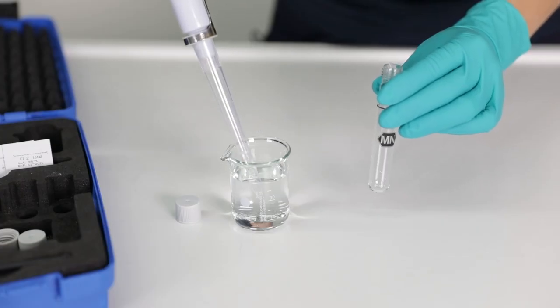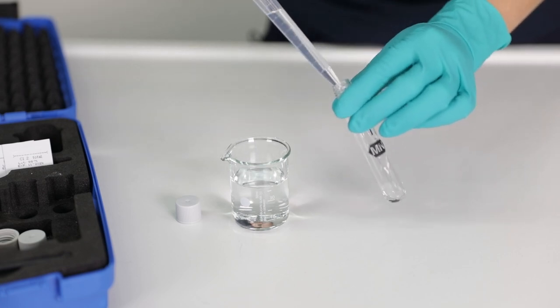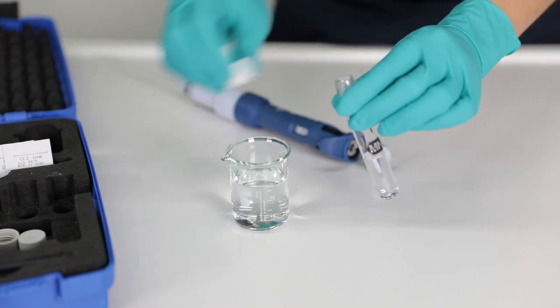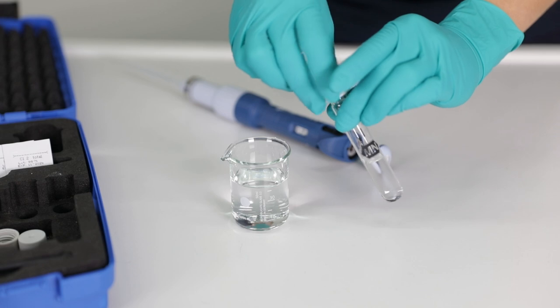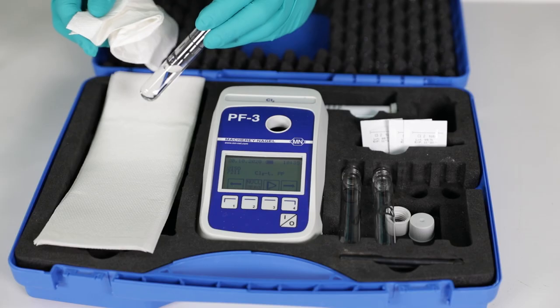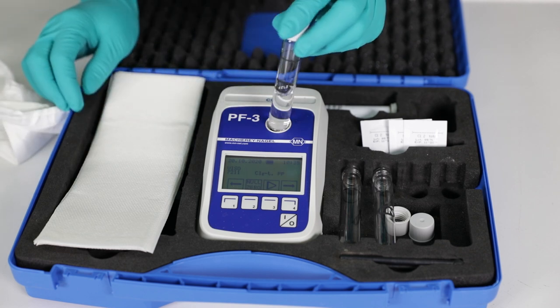Fill a cuvette with this liquid, but without adding any further chemicals. And insert it into the photometer to perform the zero measurement.